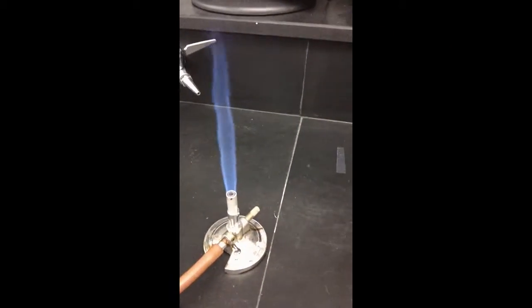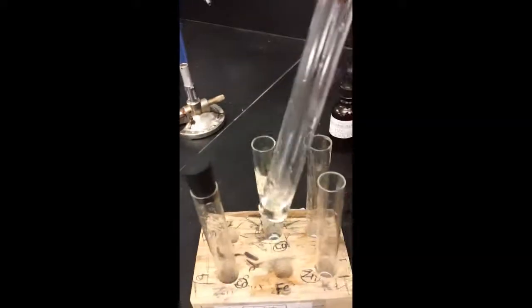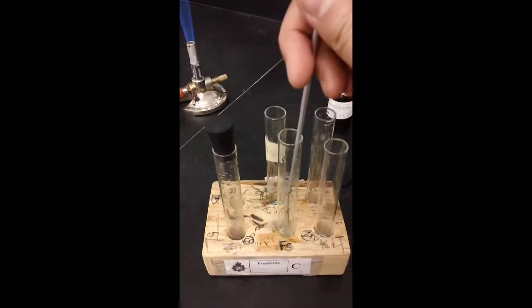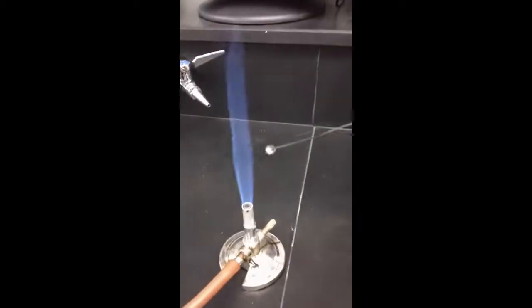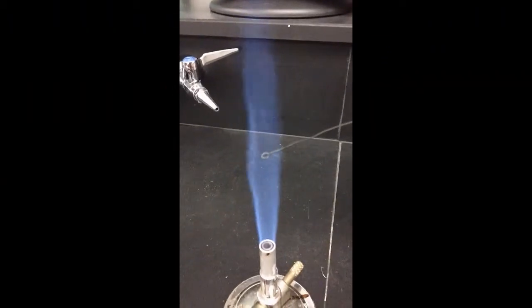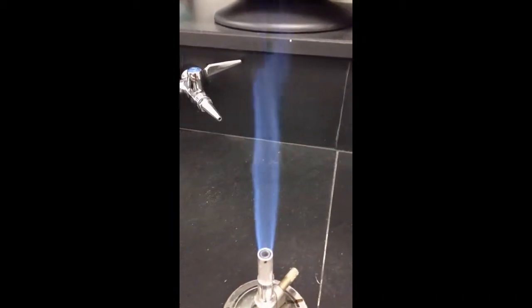Okay, so now we're going to do FE. So again, FE, this one right here. And put it in here. Make sure that we have liquid filling the loop. Oops, my bubble popped, so I gotta make sure I do it again until I have that. It's not working out for me, is it? You see that? It was quick, so I'm gonna do it one more time.